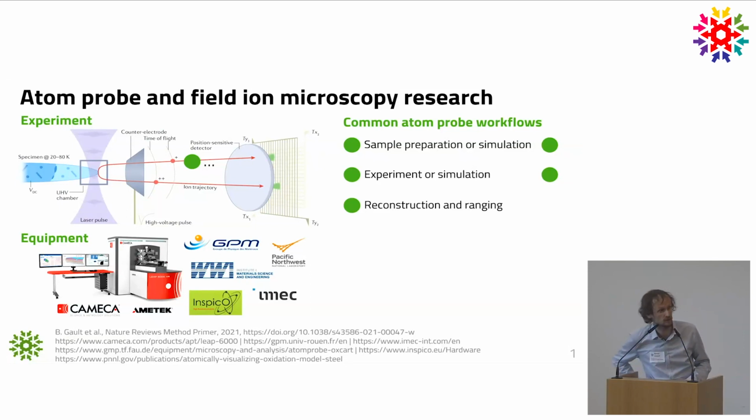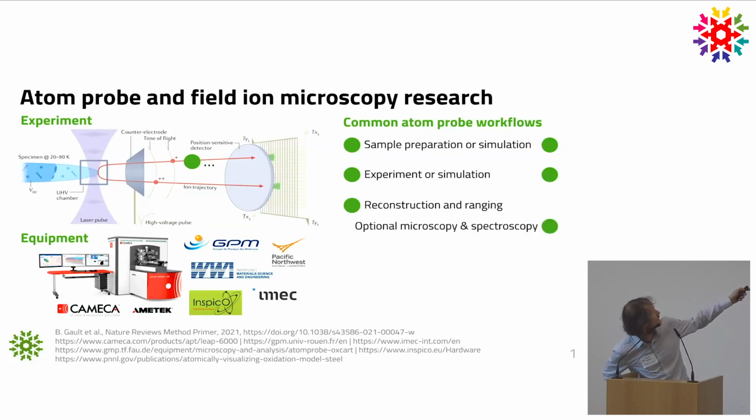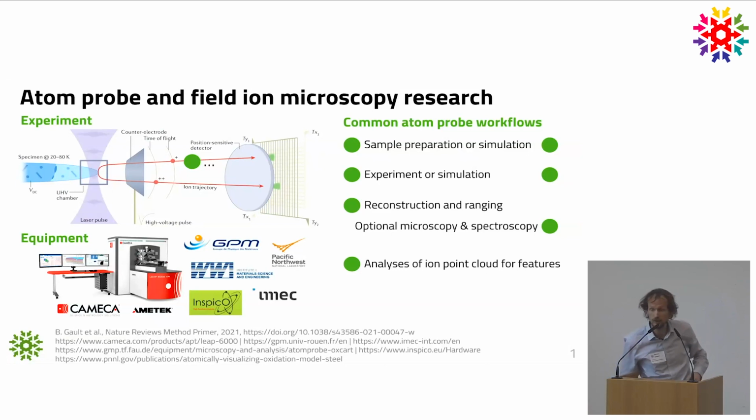There is quite an involved process, including practical steps in the lab as well as computational steps, and nowadays more and more this information is coupled with correlative microscopy and spectroscopy, to polish out the limitations the technique has with respect to spatial resolution.